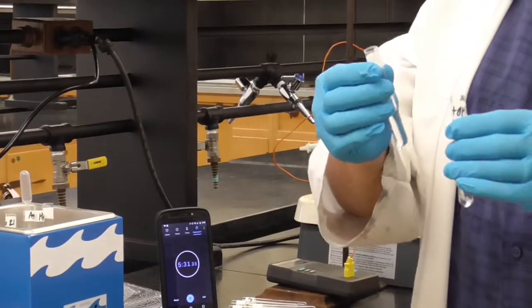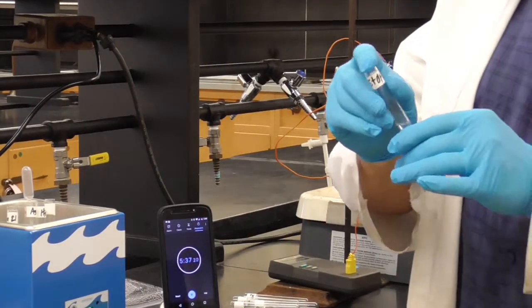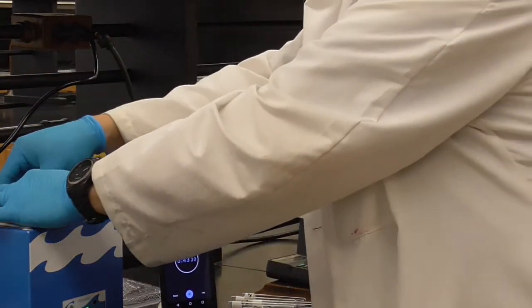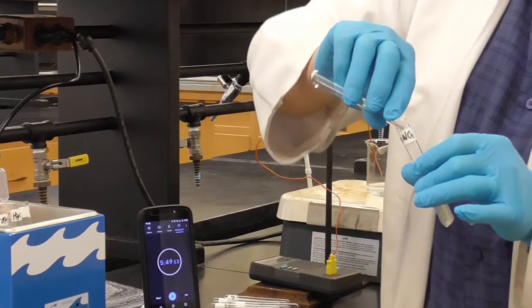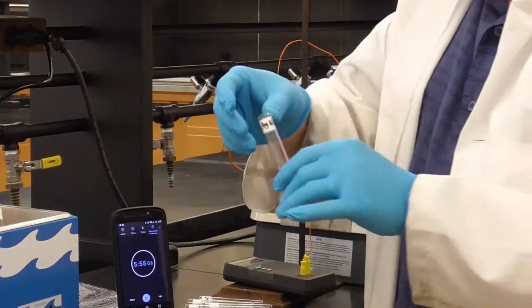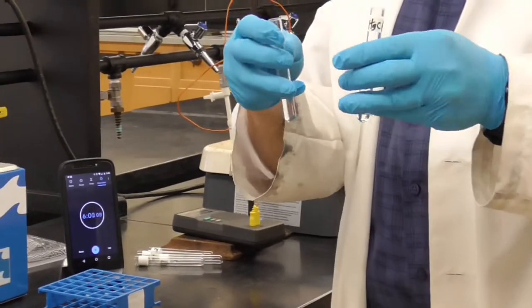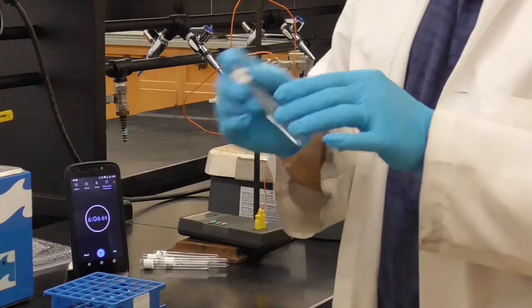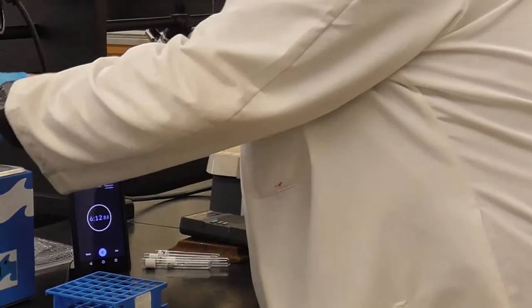Here's our ethanol and starch. Our silver nitrate with the starch. The mercury. And lead.